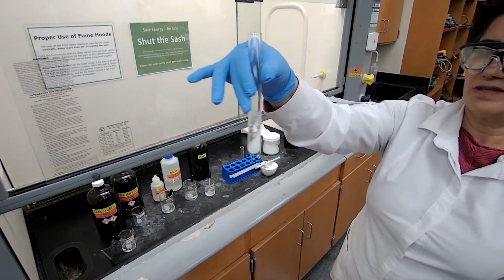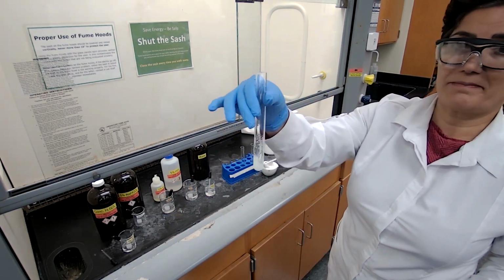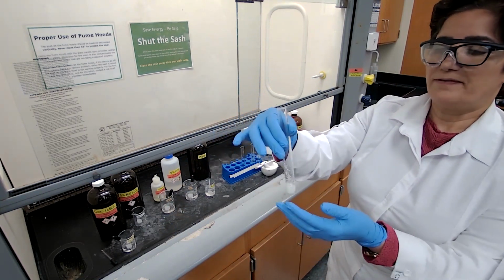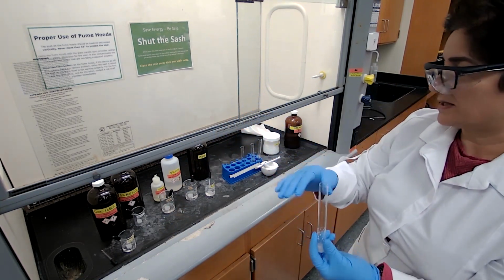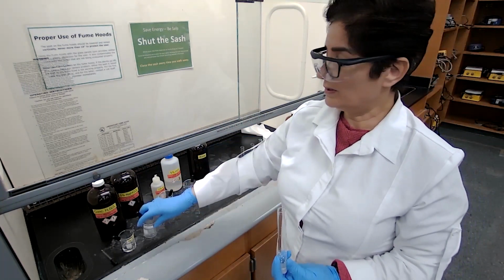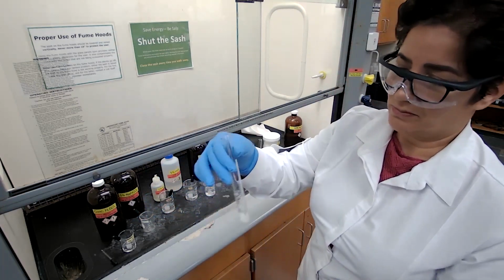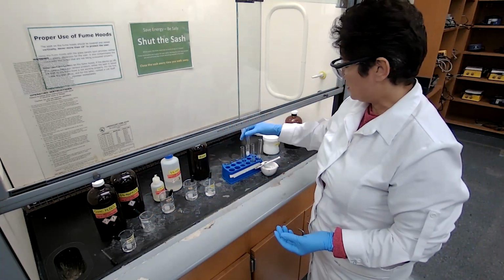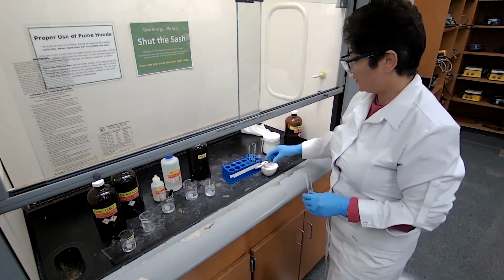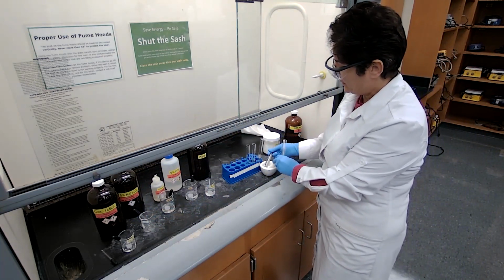It did not dissolve in sodium hydroxide. If it doesn't dissolve in sodium hydroxide, that means the compound is not acidic. So there is no need to test with sodium bicarbonate. We only test with sodium bicarbonate if it dissolves in sodium hydroxide. The last solvent that we are going to check is concentrated sulfuric acid.